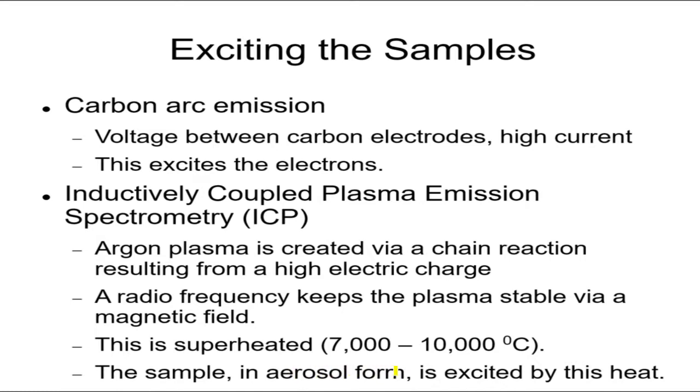You spray it in there, I'm sure it'll be vaporized by then, but anyway, the atoms in there will get their electrons excited, and you can again look at the spectrum as they emit light. You can see the different elements emitting at different wavelengths, at different frequencies. You can see what they are and see all the elements inside this sample.